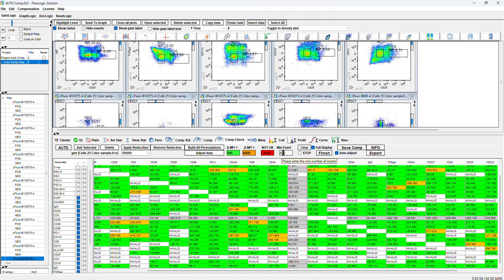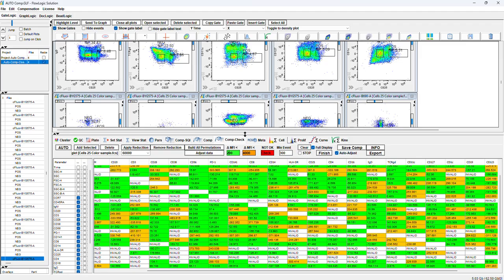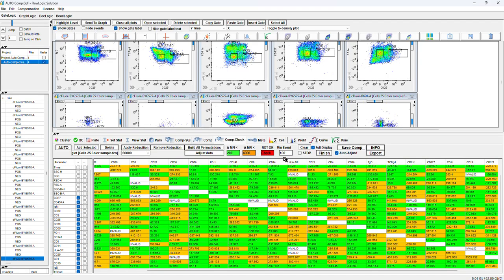Now, if you want to rerun the data and say, okay, but I want 200 instead of 300, you can just set up this 200 and you want to run, let's say, with 100. In this way, you use the available data in a different way. Then you click adjustment and FlowLogic starts the process again and will try to go through and fix all the permutations. Okay, we finish here. Thank you.